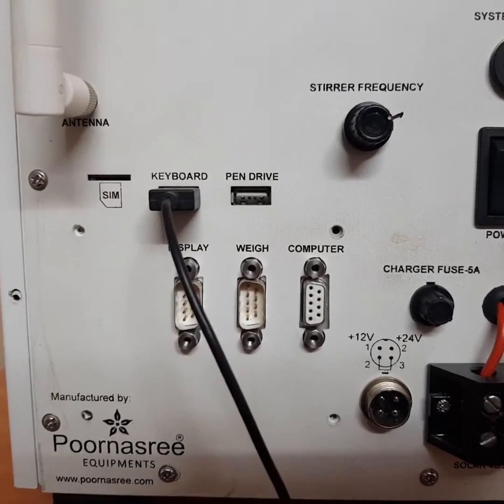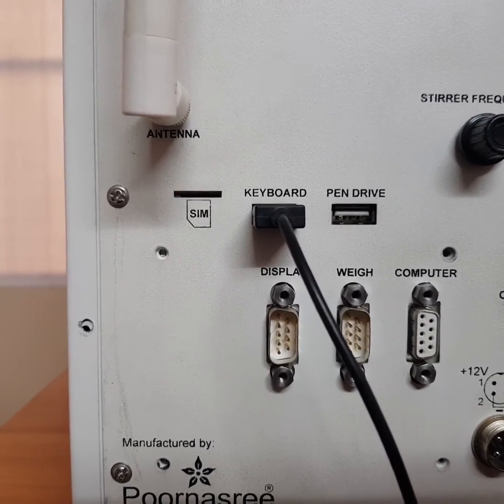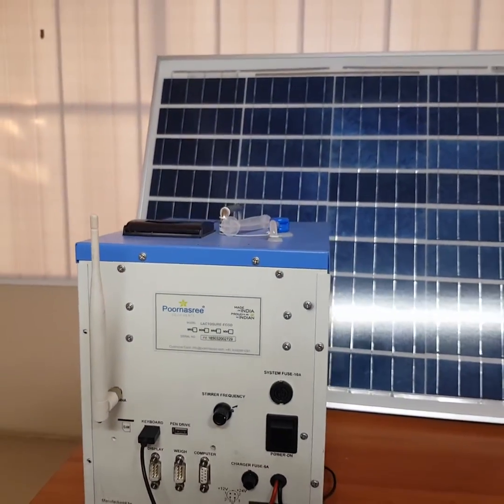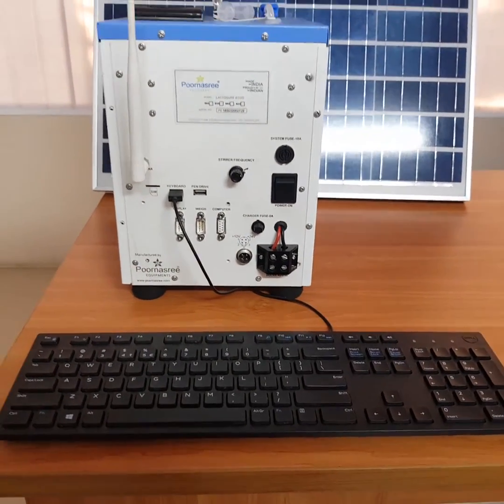Low voltage battery cutoff feature is added for extended battery life. Cloud connectivity is also available in EcoDS analyzer, where the data in the analyzer can be accessed from a centralized office and rate chart and farmer data can be updated remotely.